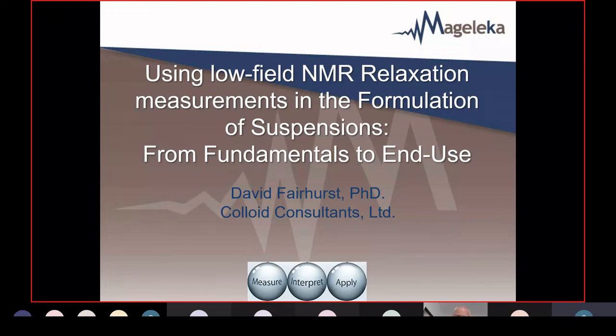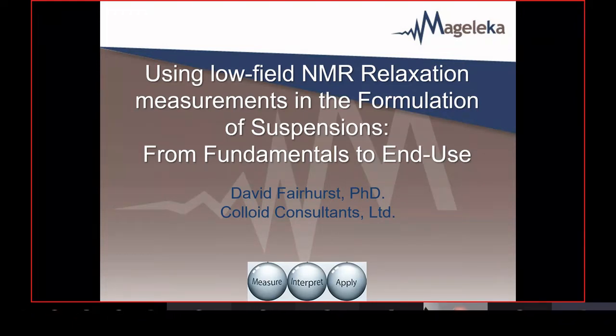Understand as I go through my talk, which is on using low field NMR relaxation measurements in the formulation of suspensions, from fundamentals to end use. Yesterday, of course, you were at the seminar with Terry Cosgrove, who talked to you about a new low field device, the Magnometer. My talk today is focused on measurements and applications using such a device.